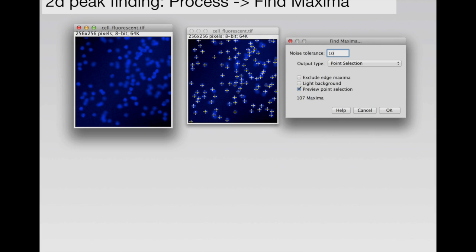And I've shown you segmentation. That's one way of finding this parameterization. Another really useful algorithm, which is very simple to use, is the Find Maxima plugin. So in my institute, they do a lot of foci analysis on nuclei. And this basically means a lot of counting bright blobs. And sometimes when you use segmentation, because it's a global threshold, it applies the same threshold across the image. If you have background effects which have an intensity profile like this, a threshold in the middle of the image isn't always appropriate on the edge.